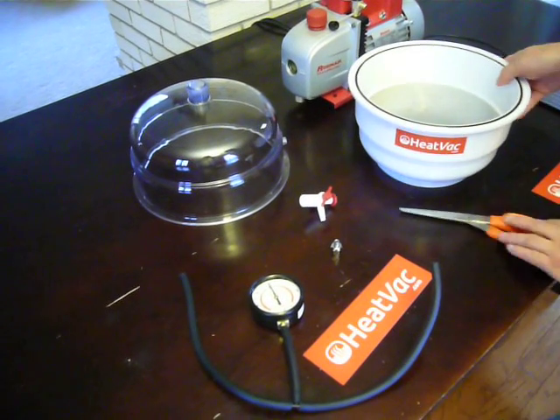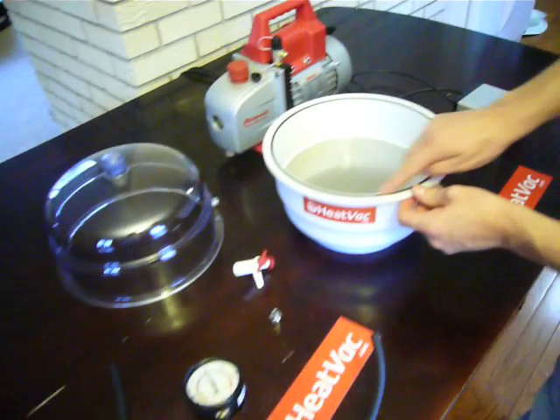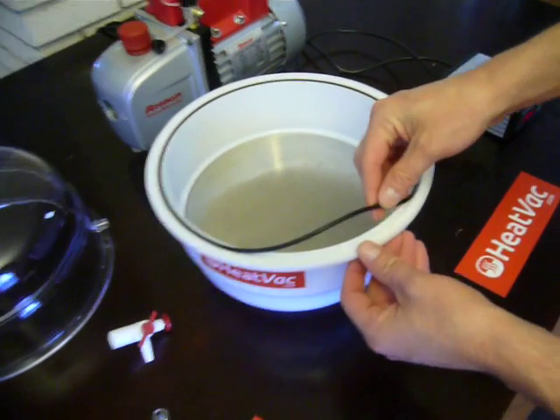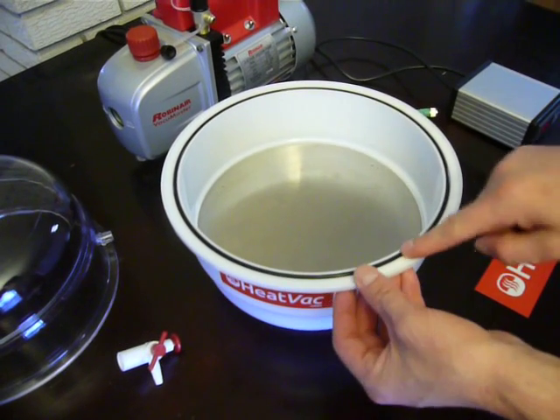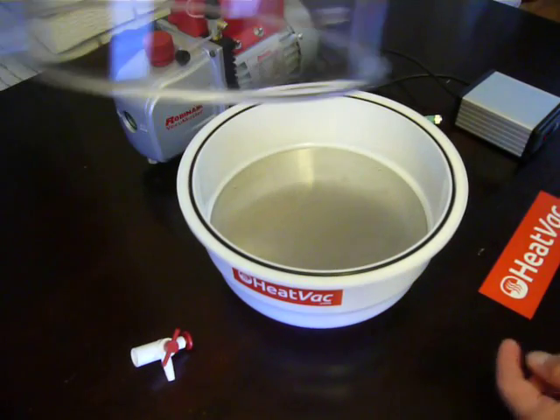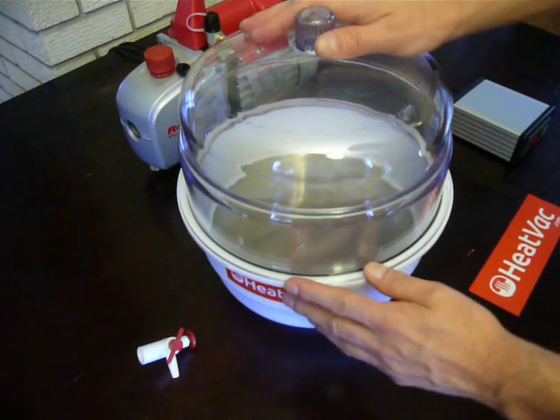The next step is to take your HeatVac. You want to put your O-ring in the slot here — it will come in the package separate, most likely. Just slide it in. If you like, you can apply a drop of silicone, just make sure you don't interfere at all with the seal. Then put your lid on top.